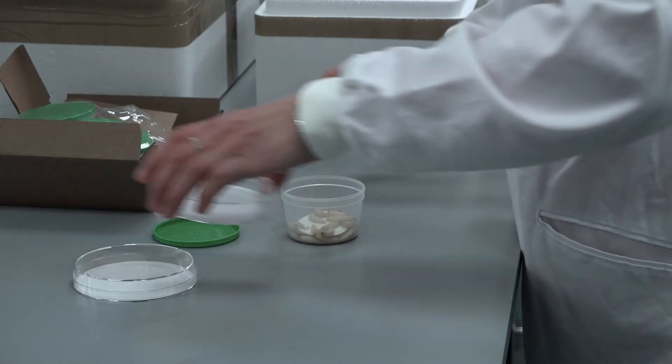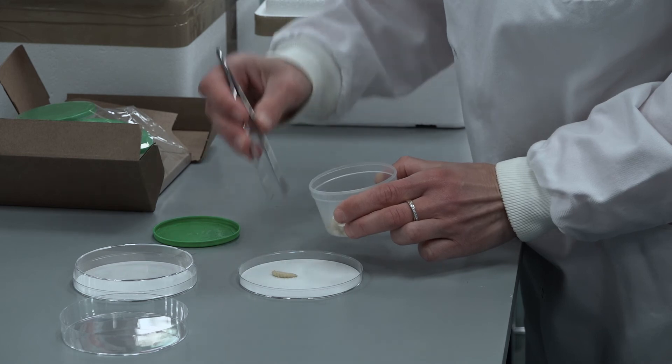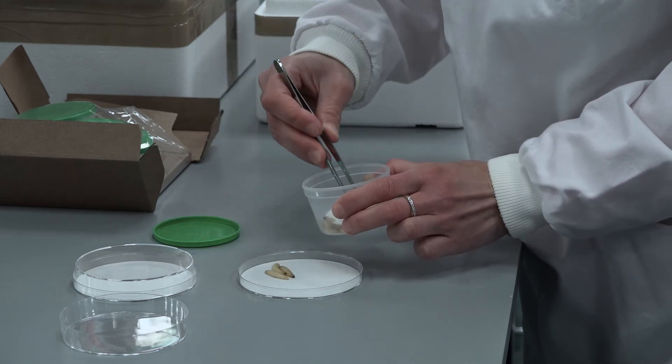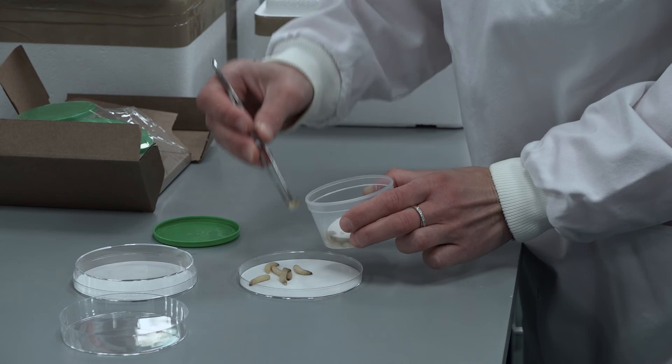If you store larvae at cooler temperatures such as 4 degrees, studies have shown that the insect immune system will be altered, which can affect experimental results. True Larve Galleria Mellonella do not require any food or water at the developmental stage used for experiments and will not eat or drink if offered.